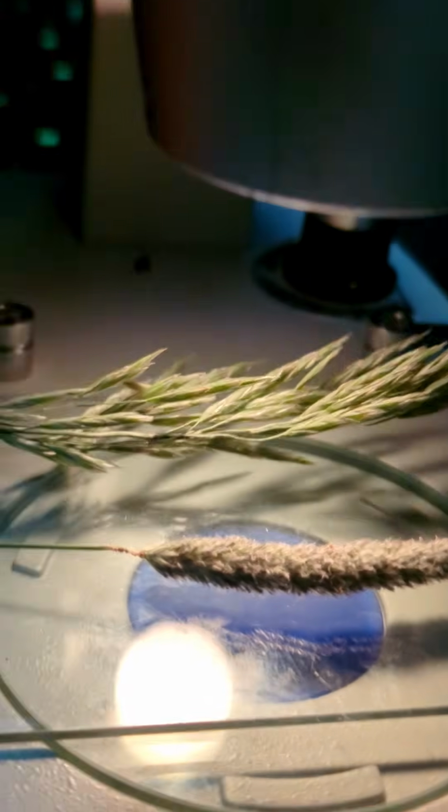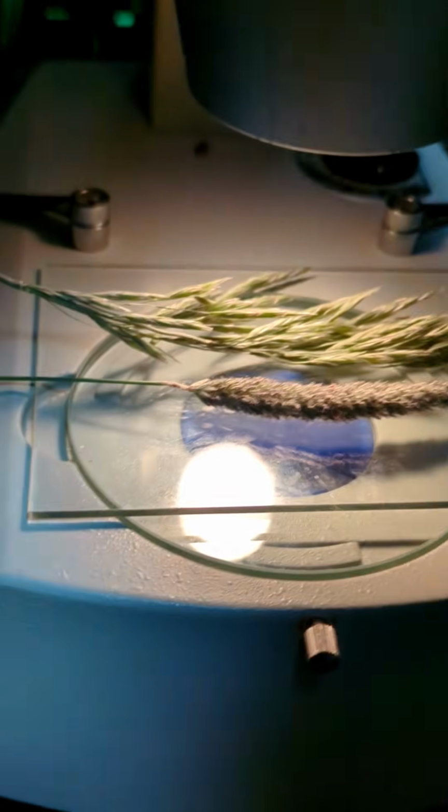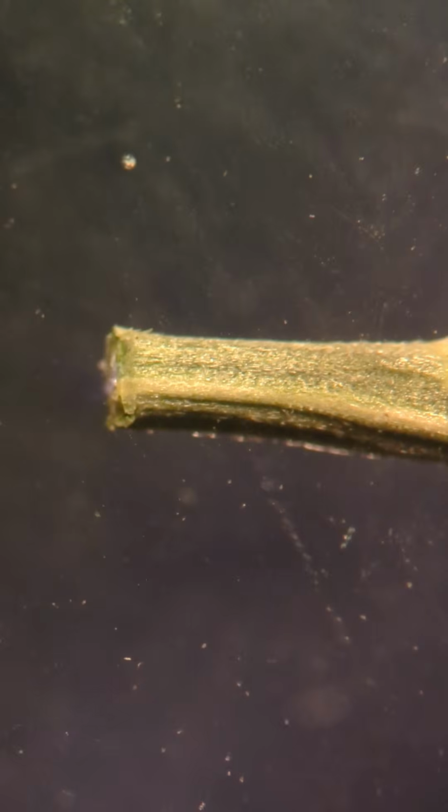Yes, they don't look like flowers because they don't have petals, and they don't need petals because they don't need a neon signboard because they don't have pollinators. They are wind pollinated. This is in the family Poaceae, and it's the same family that corn, bamboo, and probably some other stuff are. I'll try to explain the panicle, but it's just a word.